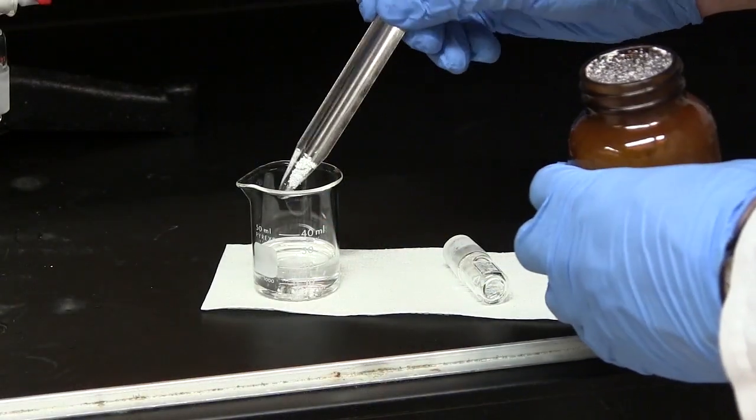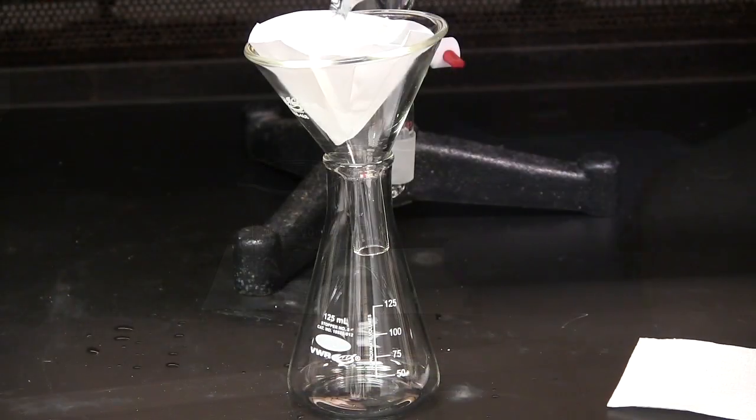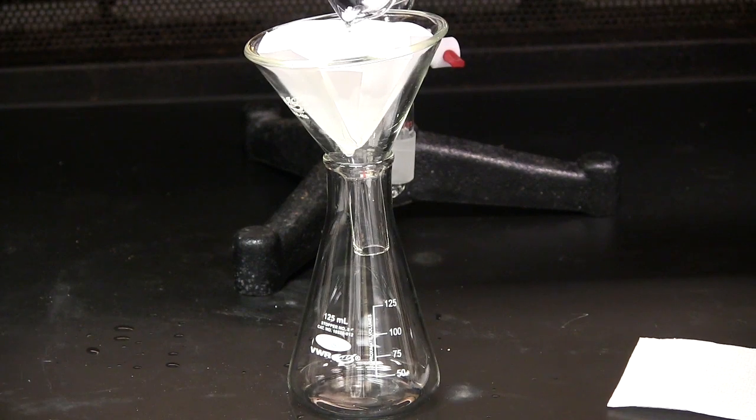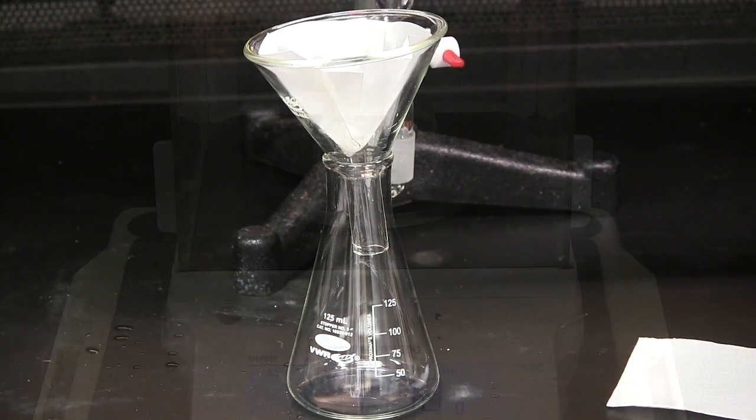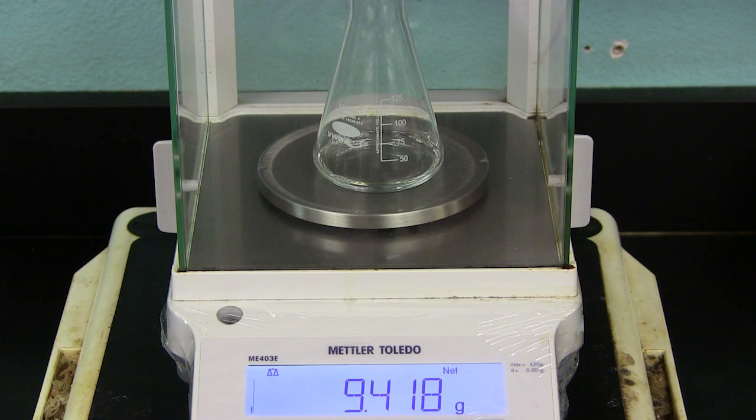Use a drying agent to dry the organic layer. Then filter the final product into an Erlenmeyer flask of known mass. Measure the mass of the flask and the isolated liquid after the filtration is complete.